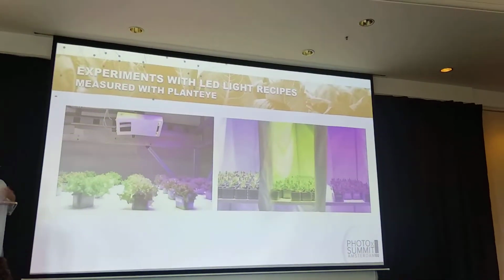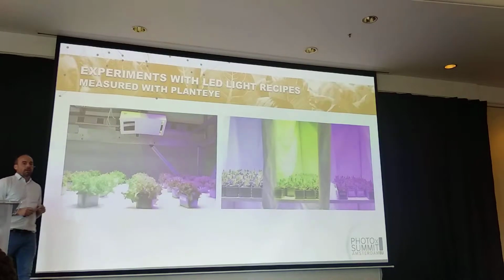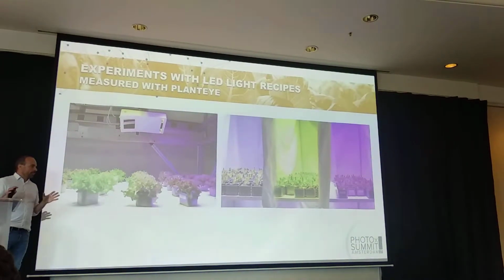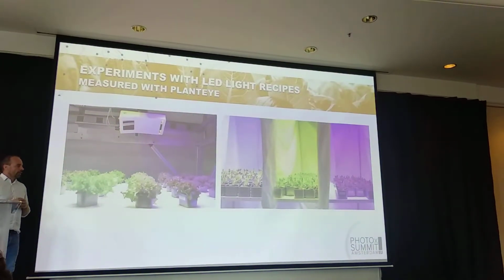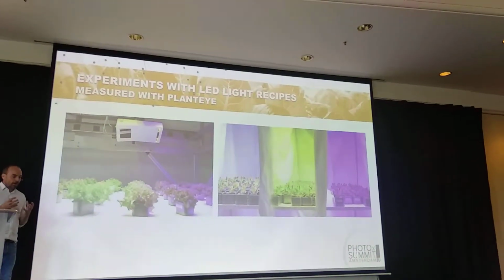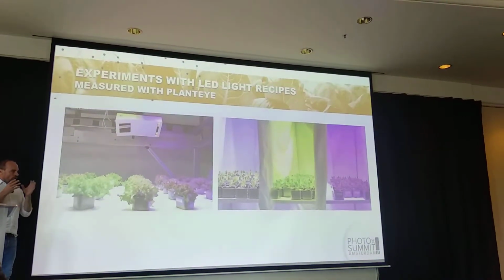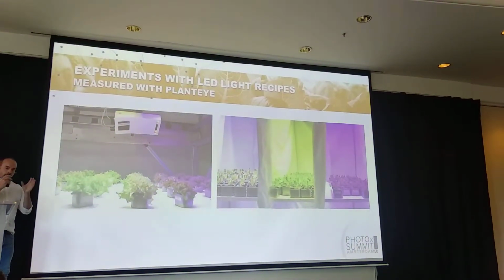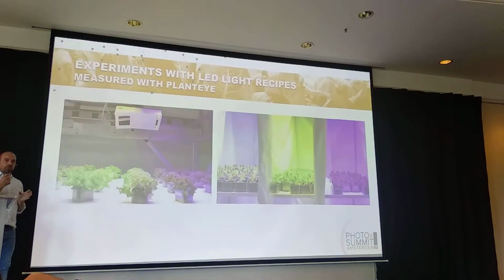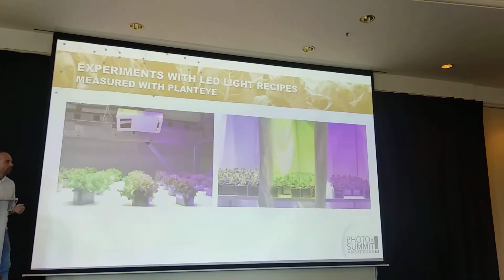So we made several experiments, and it's similar to what you did, Eric. However, the purpose is not really to go deep or to do rocket science there, and what you did is on a completely different level. For us, it was just interesting: how quickly do plants respond to a change in light, and can we capture that with our systems?